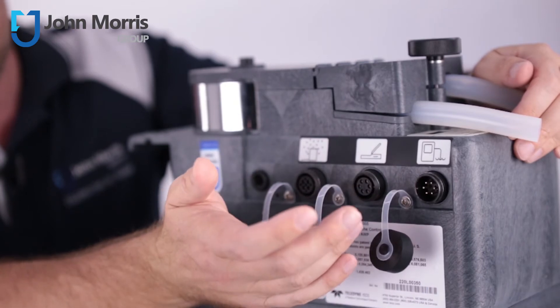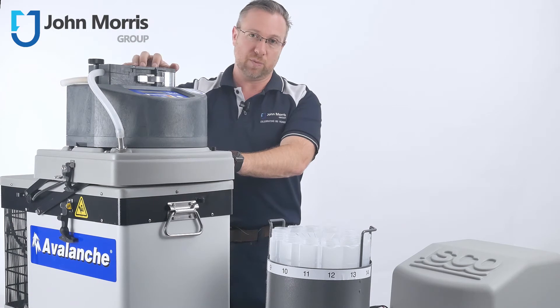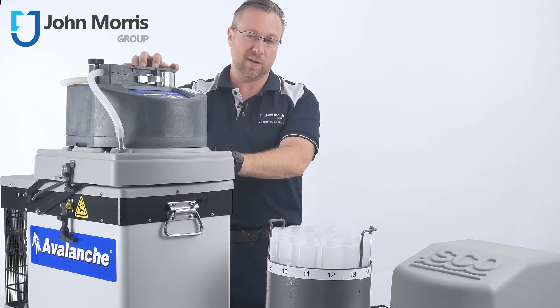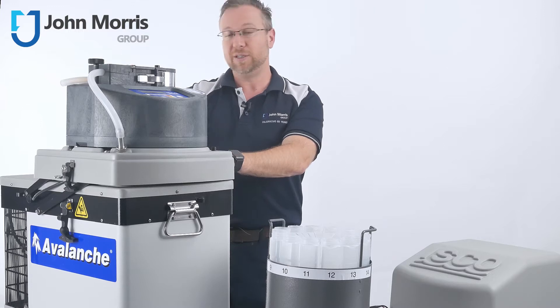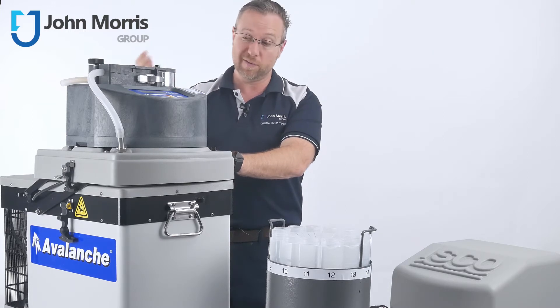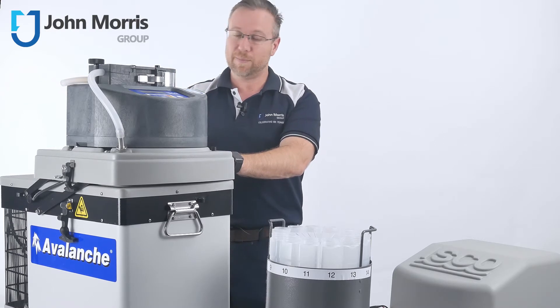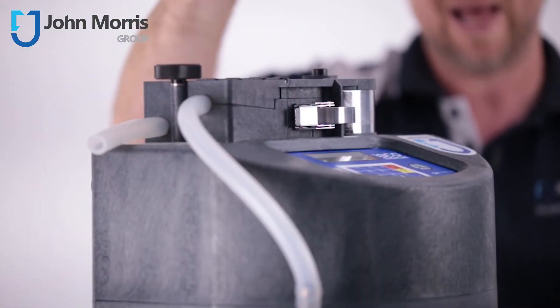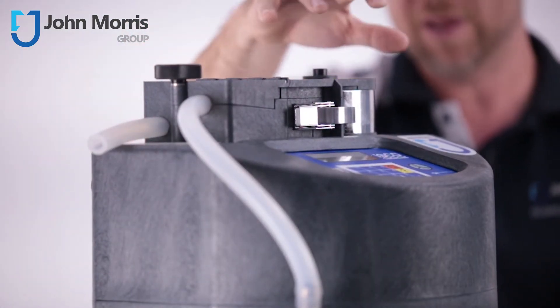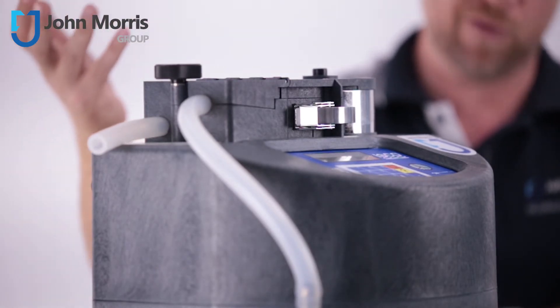You could also plug in a rain gauge or a liquid level actuator. It's also got an internal memory, so it will store all of the data — when you took the sample, any errors, and any sensors that you have connected. This device will also take SDI-12 sensors, so that could be a sonde, for instance, that might allow you to do multiple parameters. If you use any of those things, it'll store all the data on here, and then you can export it via cable to your computer for viewing.